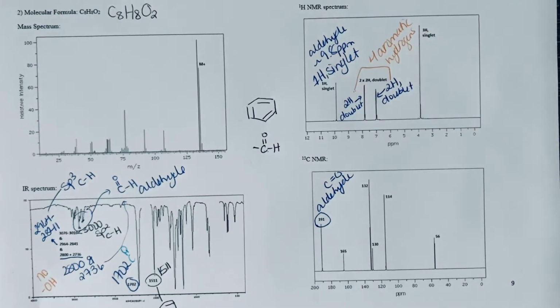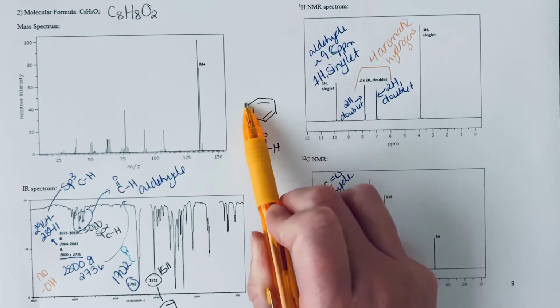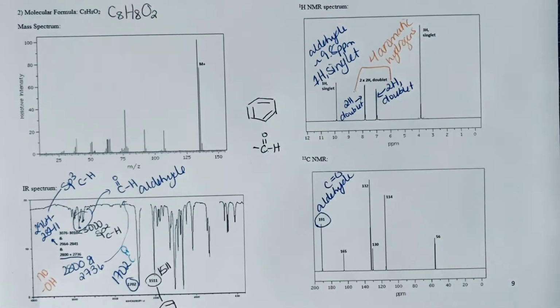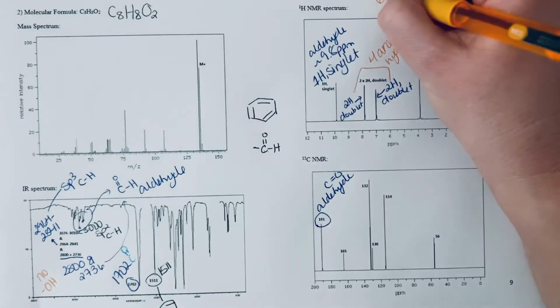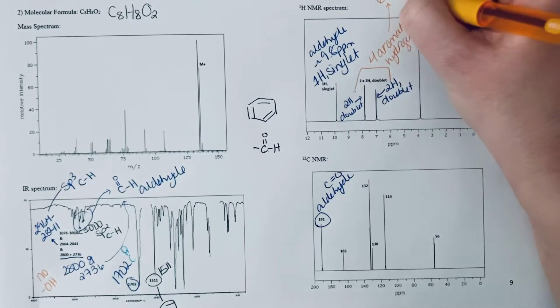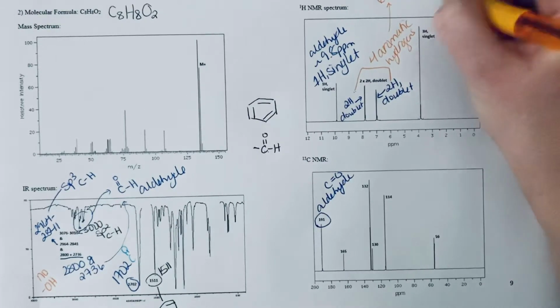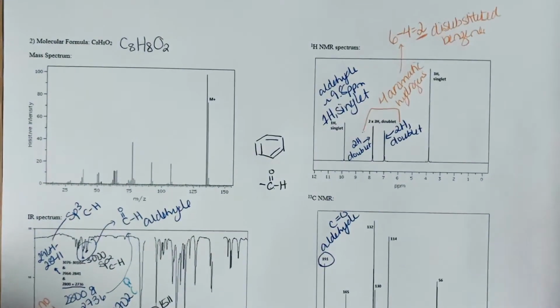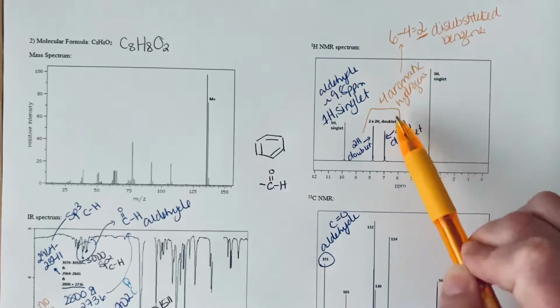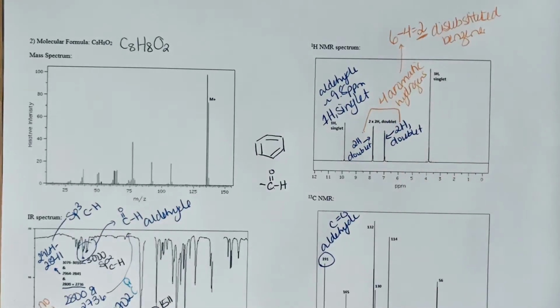And so this gives us information about how our benzene ring is substituted. If it was an unsubstituted benzene, every single one of these carbons would have a hydrogen, so there would be 6. So we can say 6 is an unsubstituted benzene. Subtract from that 4 and you see 2. This tells us that we have a di-substituted benzene. Okay, so 6 is the number of hydrogens on a normal unsubstituted benzene ring. Subtract 4, that tells you how many substitutions you've made on the ring. If you only have 4 aromatic hydrogens, you replaced them with 2 other things.